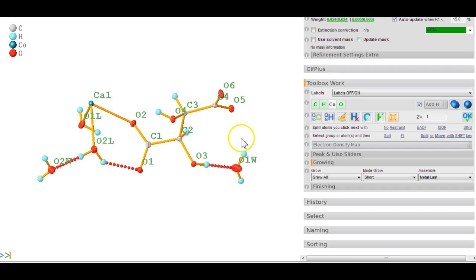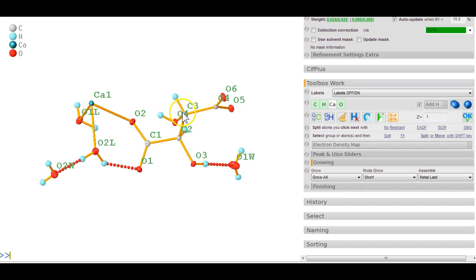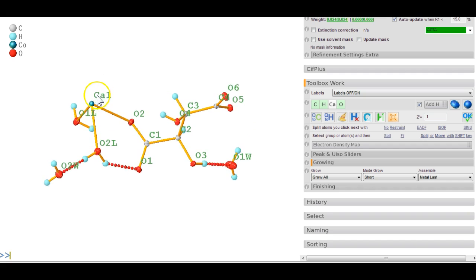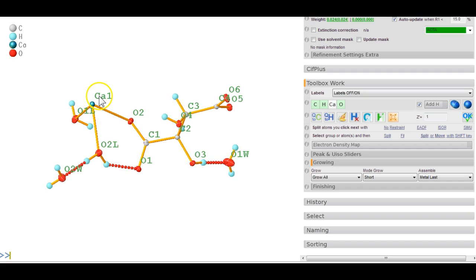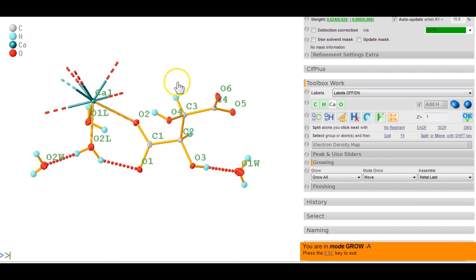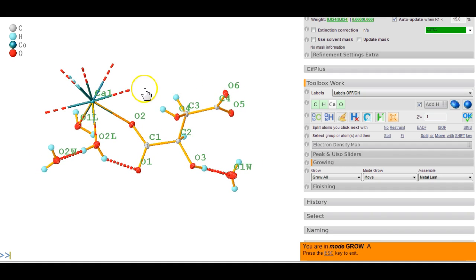This is not a bad representation—you've got your whole molecule and your calcium. But you might not want this. You can select the calcium and say I want to grow more atoms. Now you see all the atoms that are bound to this calcium. If I click on this, it will move oxygen six over.